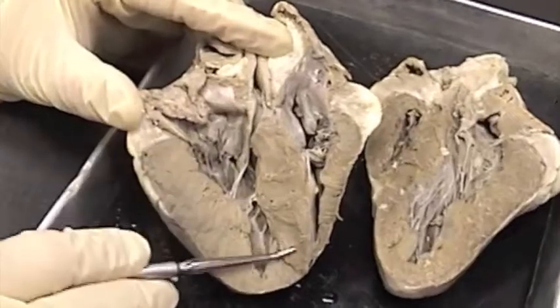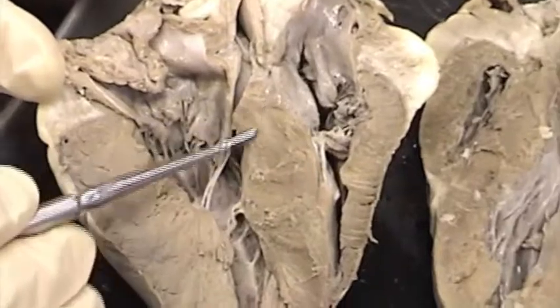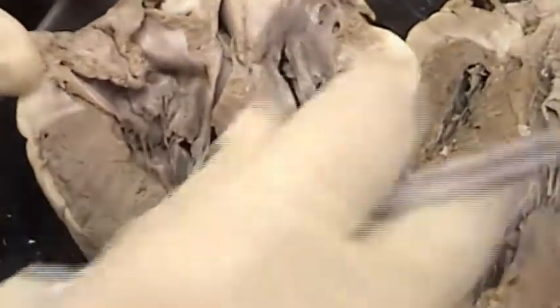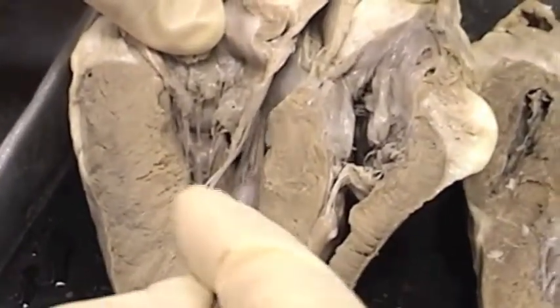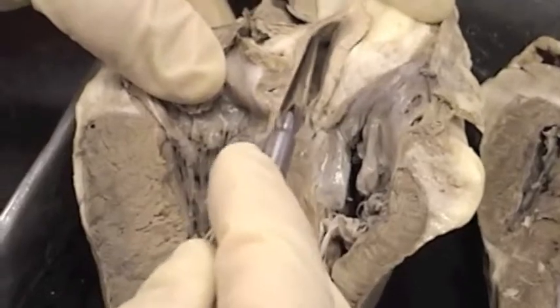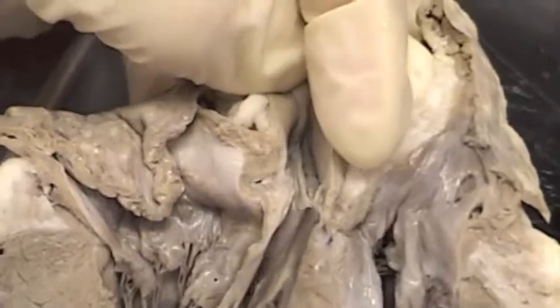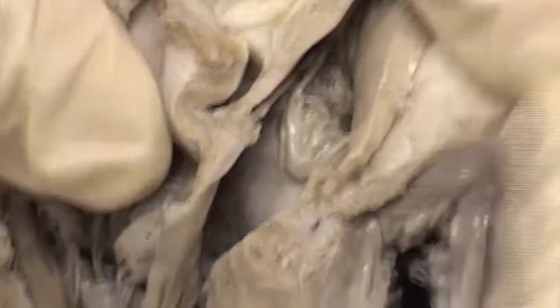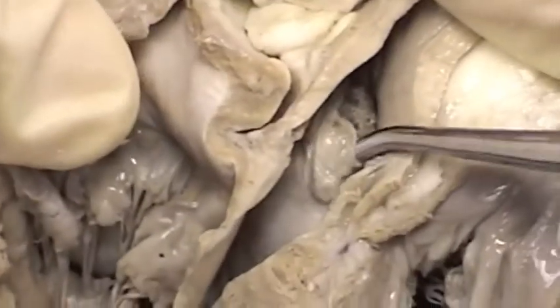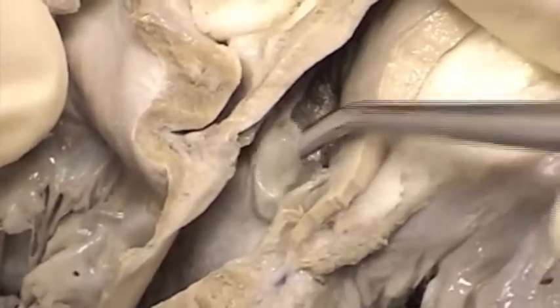We have a big septum between the right and the left ventricle — this is the interventricular septum. On this particular heart we can see that the left ventricle attaches to a large artery, and though part of it is cut off, this large artery attached to the left ventricle is the aorta. This is a good one because it shows this little pouch right here that the probe is in — that pouch is the aortic semilunar valve.